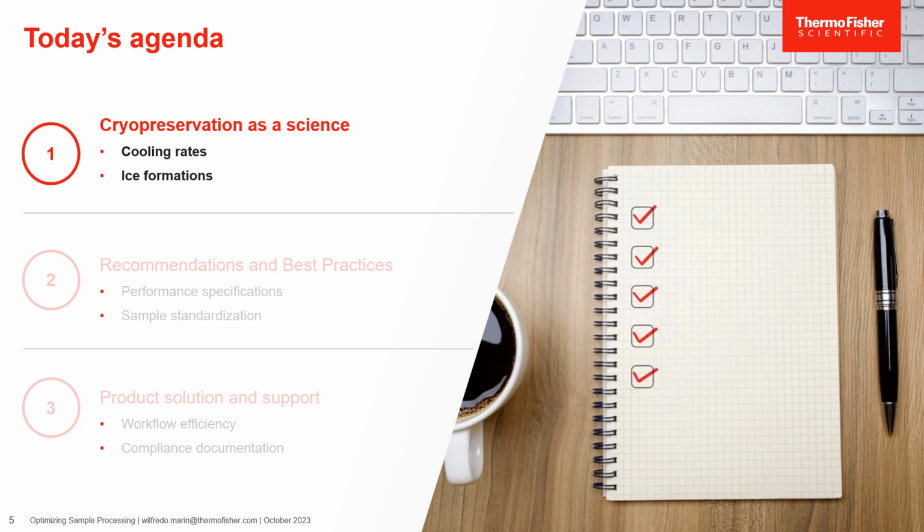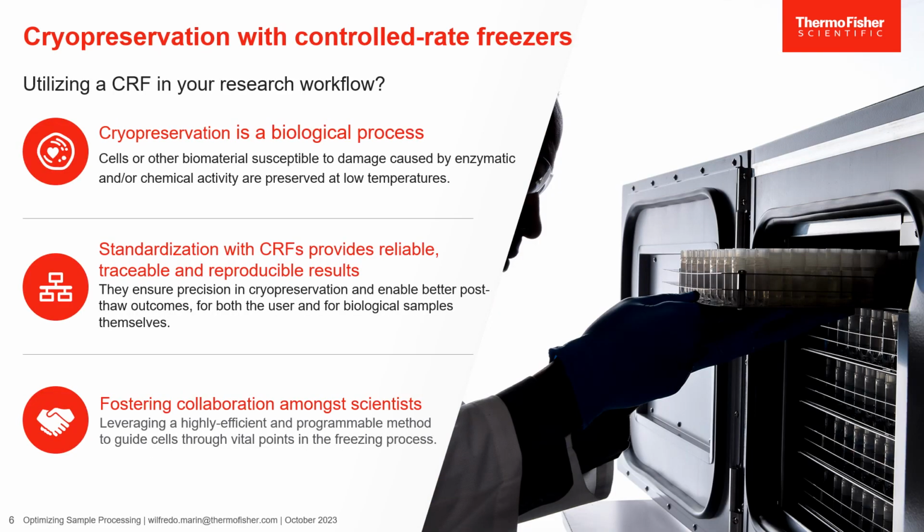I do want to mention in this webinar that it's important when working within the field of cryopreservation that we consider control rate freezers. And the reasoning is fairly simple. We understand cryopreservation as a biological process. We know that if we bring cells down to cryogenic temperatures, if they were normally susceptible to any damage due to enzymatic or chemical activity, that will be halted and they'll be preserved much better.